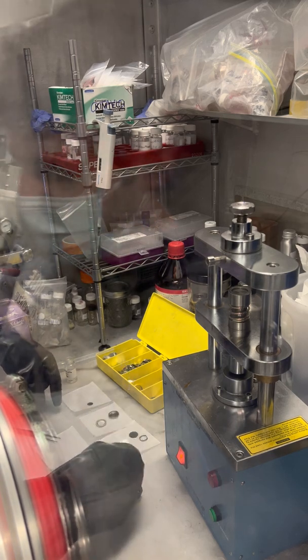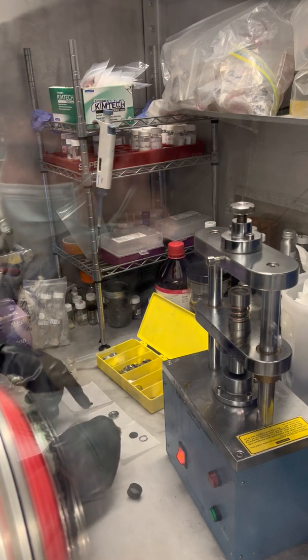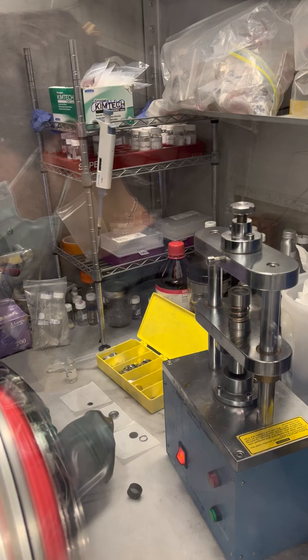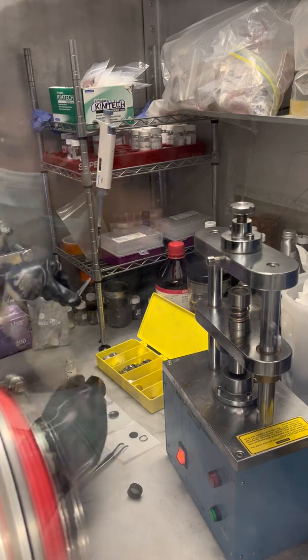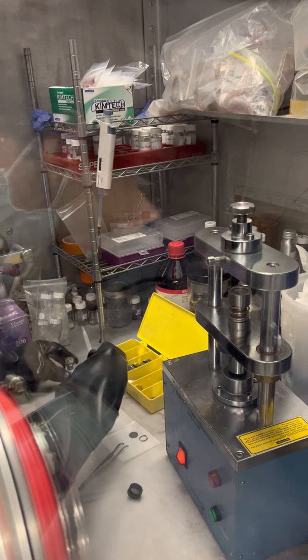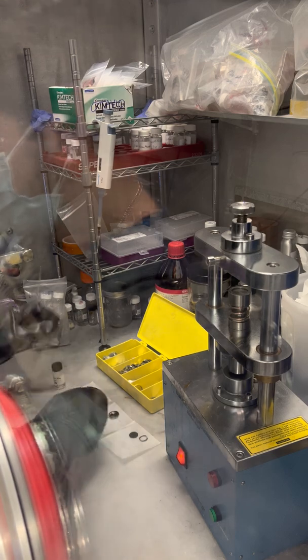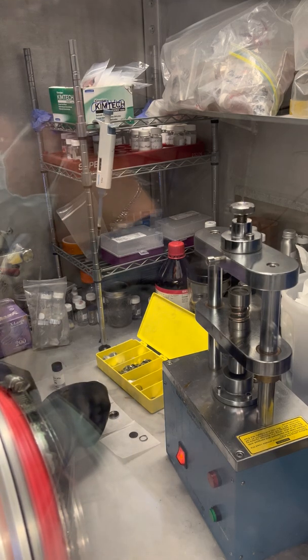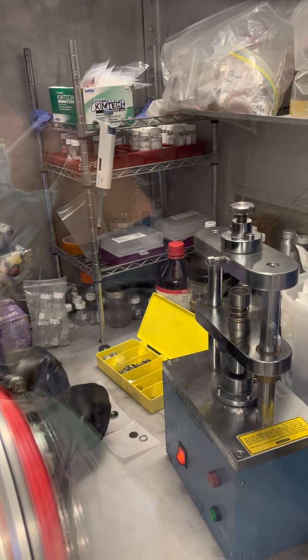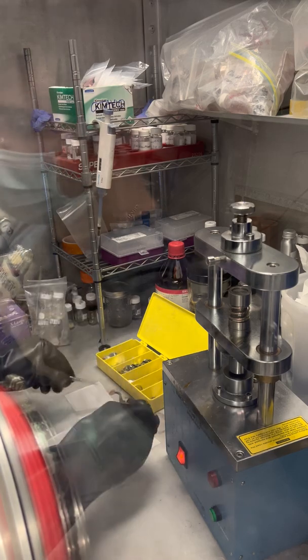Then the separator — a Celgard polymeric membrane — which will avoid any electric contact between the lithium metal and our electrode. One more drop of the electrolyte to wet this side of the cell. Then our electrode: since it will react with the lithium foil, we place it upside down, with the active material facing down toward the lithium.